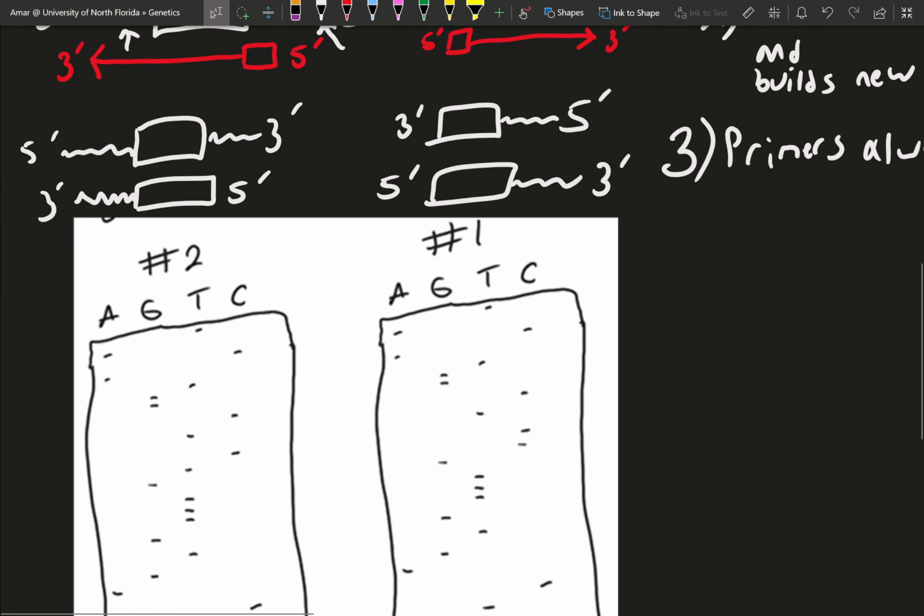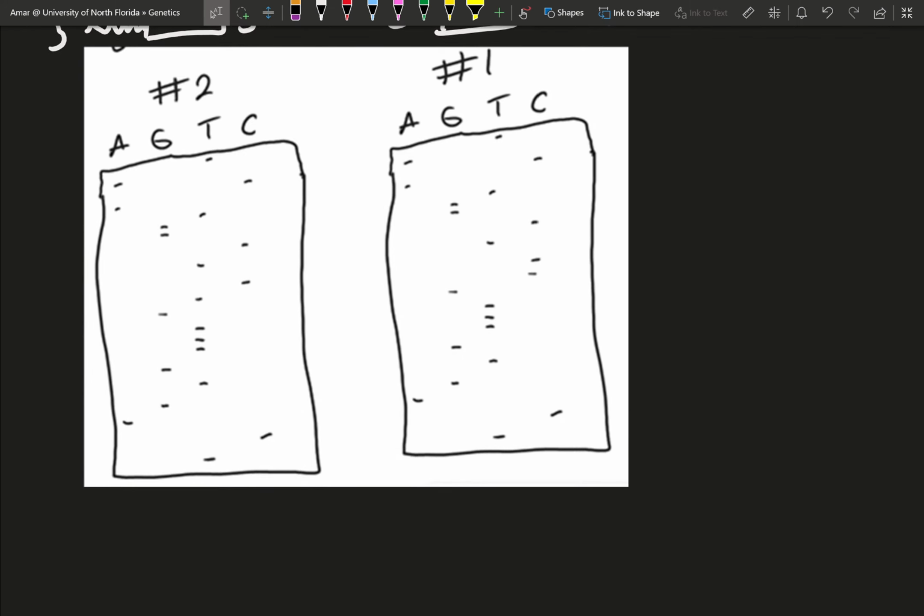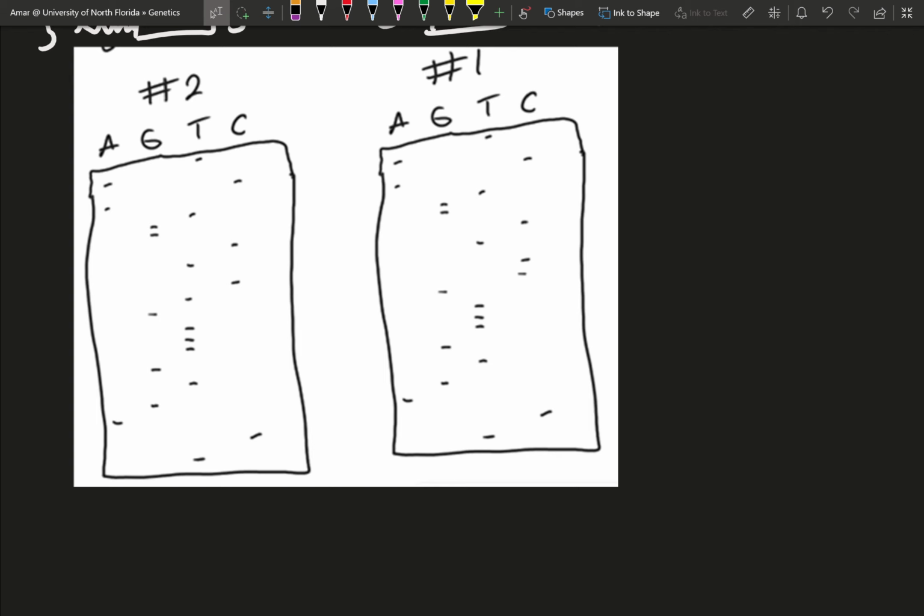Okay. And then next up, Sanger sequencing. Now this one is a weird one because some professors have different requirements for this kind of question, and some don't. Most of the time, what I've seen is that, depending on what your professor wants you to do, some professors just give you the sequence of a particular gene and then just analyze what the sequence is from 5 to 3. Some don't. You have to do a little bit more work, and we're going to go over that real quick.